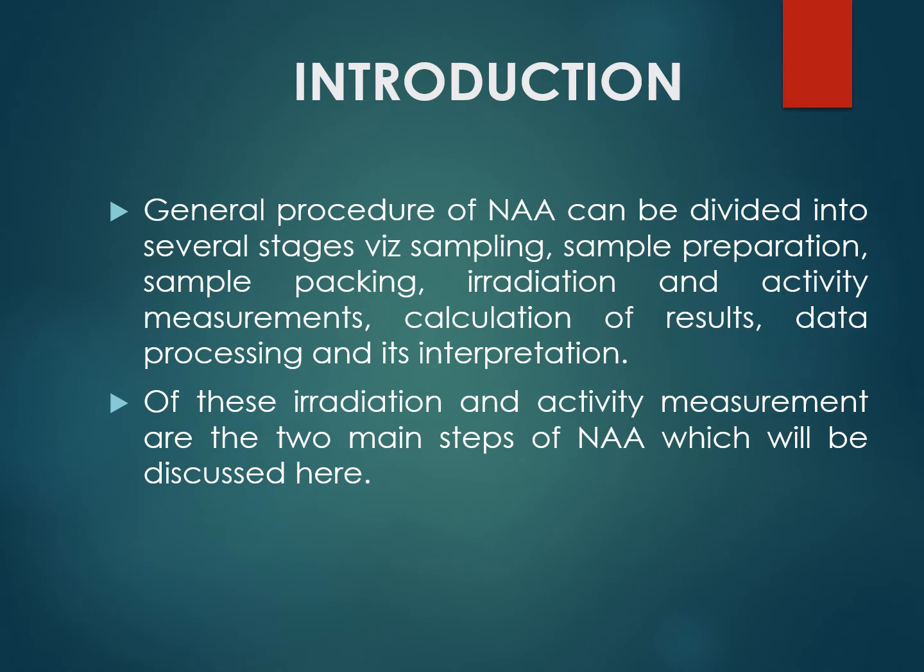The sample is passed through different steps. The bulk amount of the sample which we have collected from a specific site is known as the lot sample, which may be a gross or large amount of the sample.